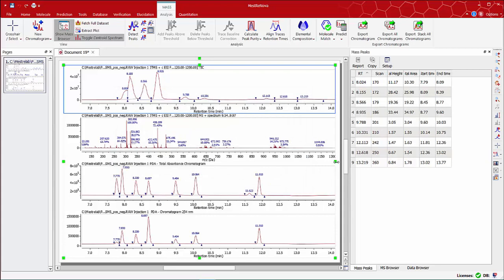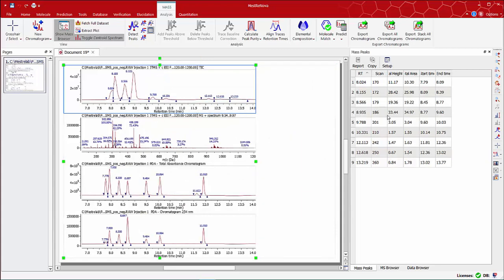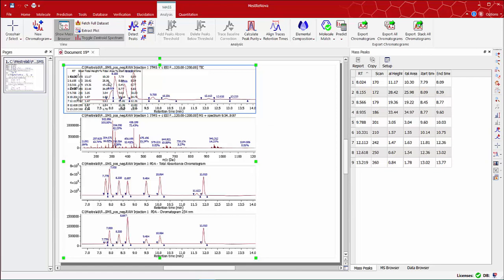You can import this table. Just click on the Report button and place the table where you wish.